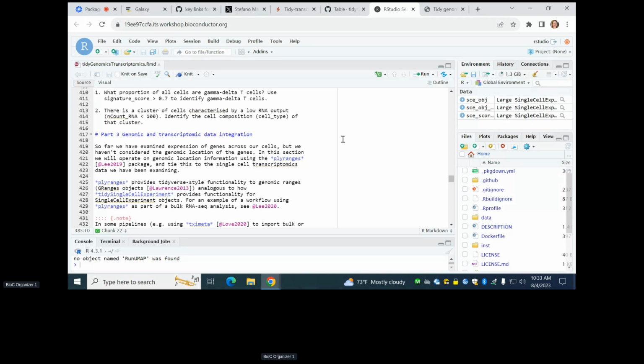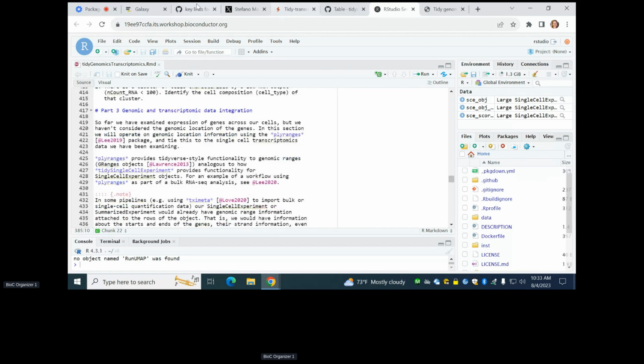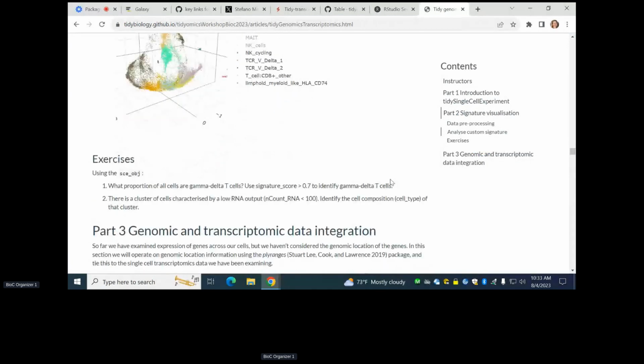Thank you. So I want to also make sure to leave enough time for questions. So I'm going to jump through this, but again, you have the full rendered version as well.